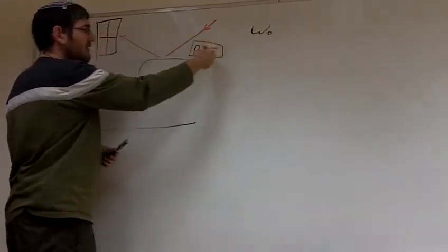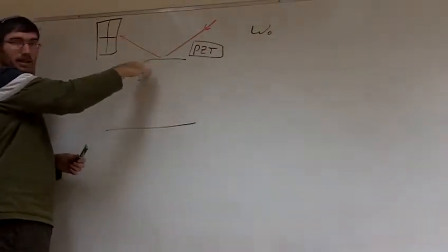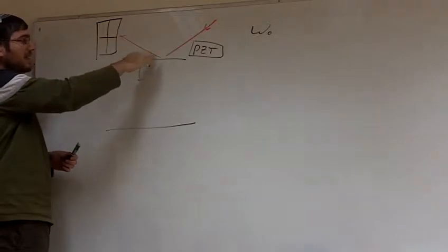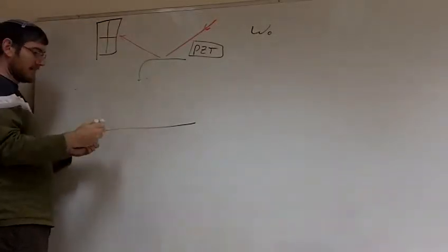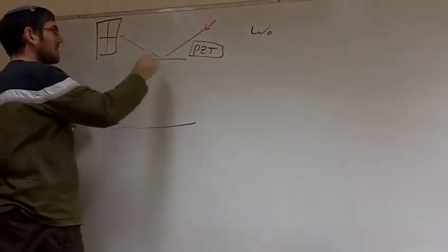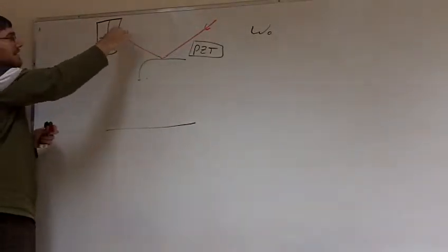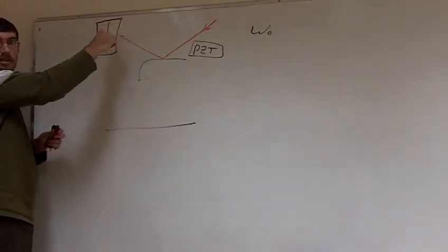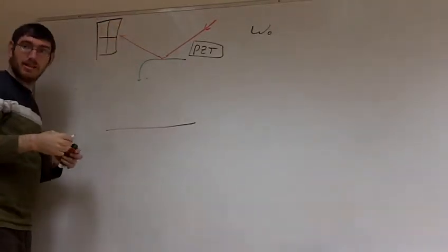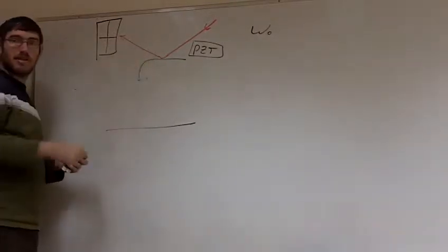And it's vibrating, and it's causing the tip to vibrate. When the tip vibrates, the laser, which is hitting it, is also changing. AC change always up and down on the detector. So the detector is what's monitoring the oscillation of the tip.